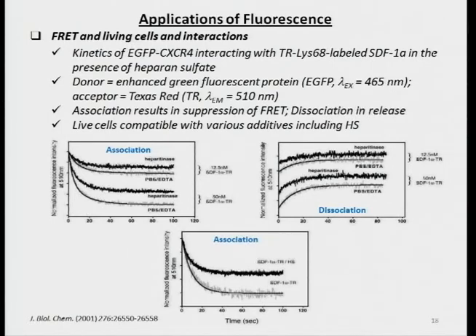And then this, in essence, is the same thing in buffer, where heparan sulfate was added to the medium. So this is in cells. Heparan sulfate was added to the medium, and basically there is no change whether the heparan sulfate is present or not. So in essence, this is a result that is completely opposite to what I thought was actually happening: heparan sulfate modulating the interaction and making it favorable and things of that sort.